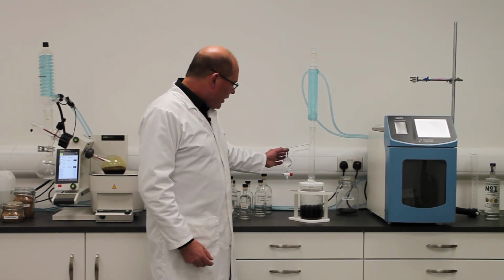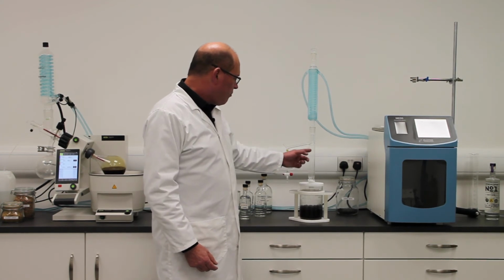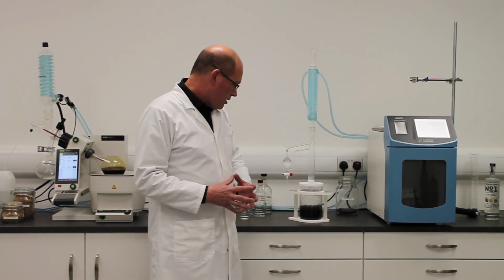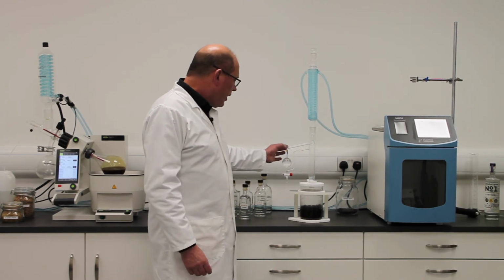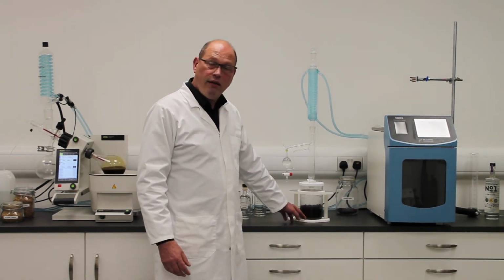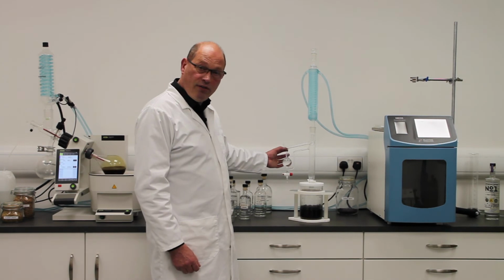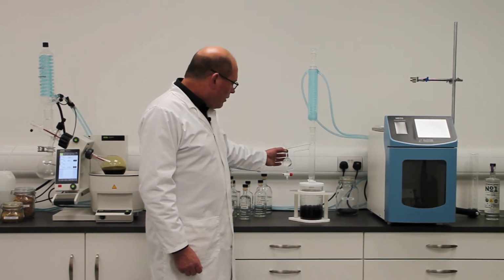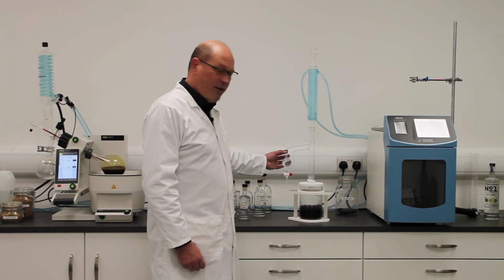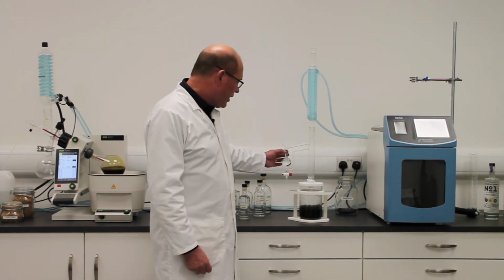of the apparatus. And what happens, the oils float on water, and the excess water drains back into the still, keeping the juniper berries with water in them. And this here, I've run this for 20 minutes, which is all you need to do to extract this weight of juniper berries. And you can see we've collected about 1 millilitre of essential oils from that. That essential oil, although it doesn't look much, is enough for over 100 litres of gin. And that's the beauty of it, because it's just the essence of juniper here.